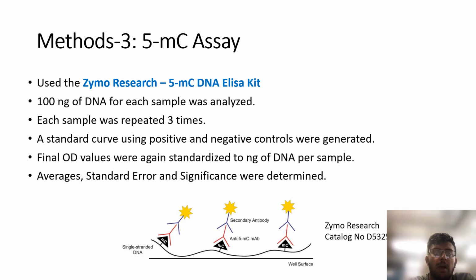Now we did the 5-mC assay. We used the Zymo Research 5-mC DNA ELISA kit. Each DNA sample was analyzed in repeat. A standard curve was generated. OD values were standardized again. Averages, standard error, and significance were determined.